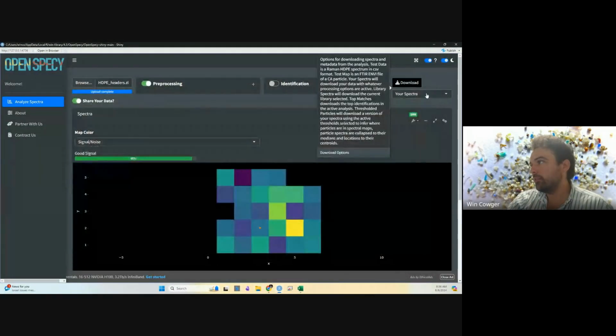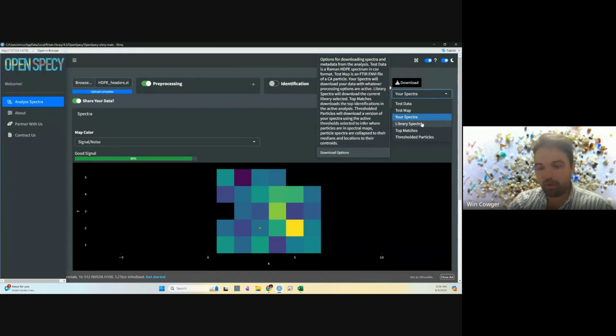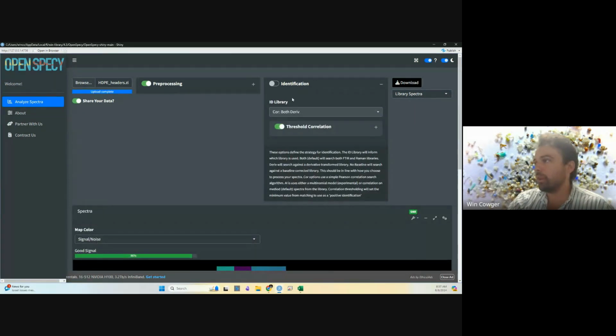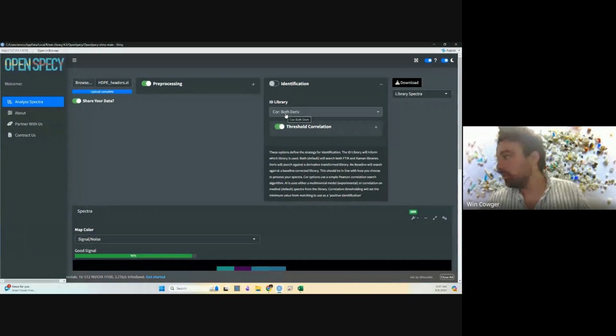All right. And similarly, if you've never downloaded your library spectra, I would also encourage you to download that spectra. That will download whatever library you have selected here. And I'll just go over the library selections real quick.